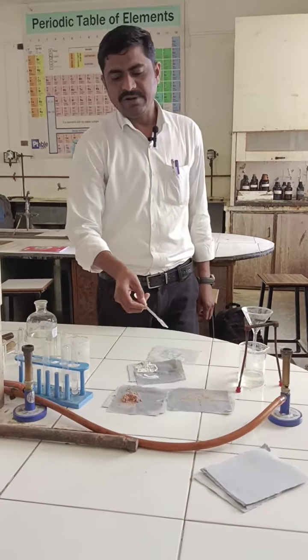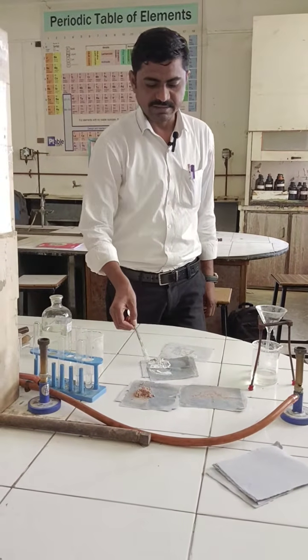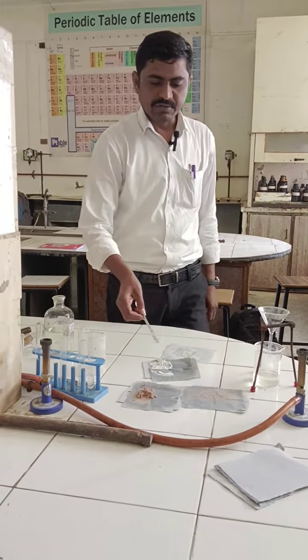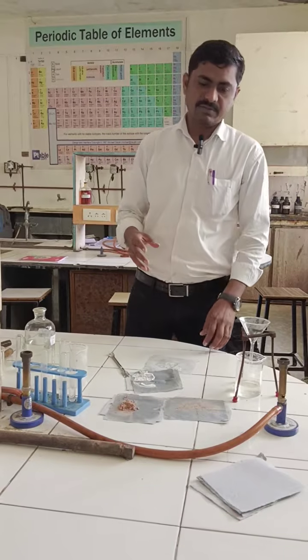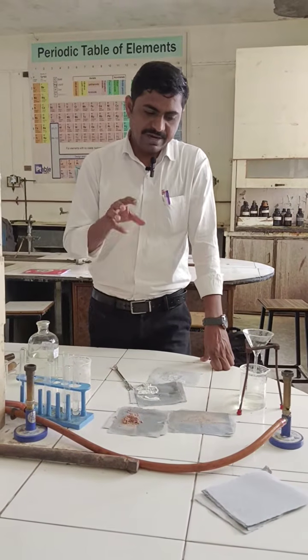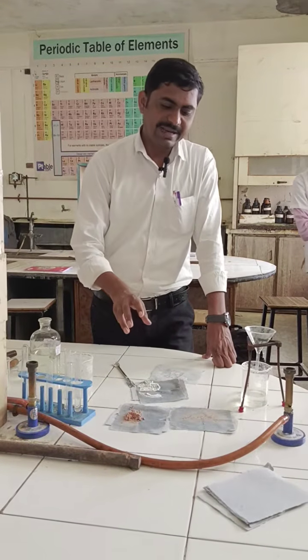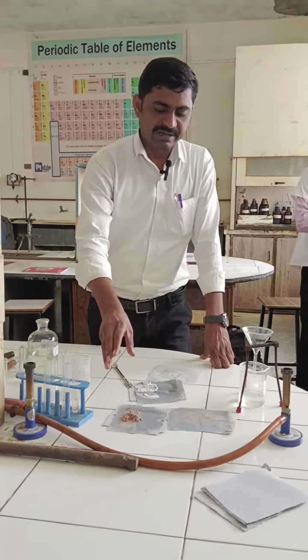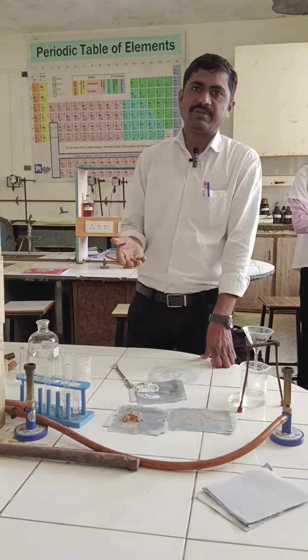This is a phenol, actually a beta naphthol, and this one is a salicylic acid. We cannot draw the conclusion before performing the tests, but we have separated two compounds. At this point we can conclude that one compound is acid and the other is not yet determined. By performing individual tests we can determine the nature of both compounds.